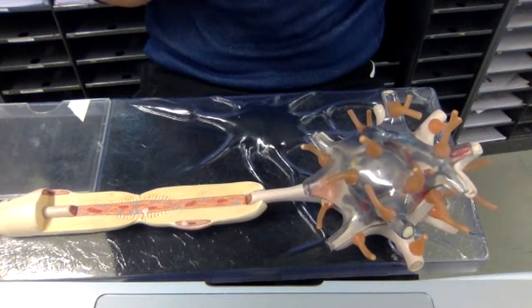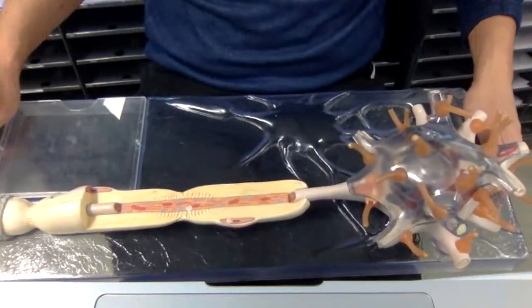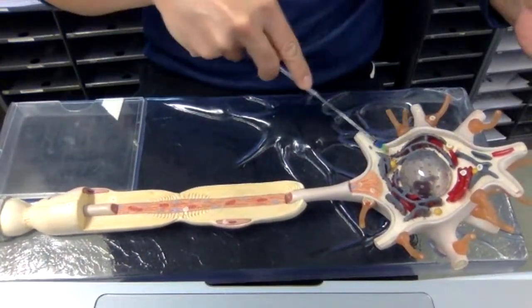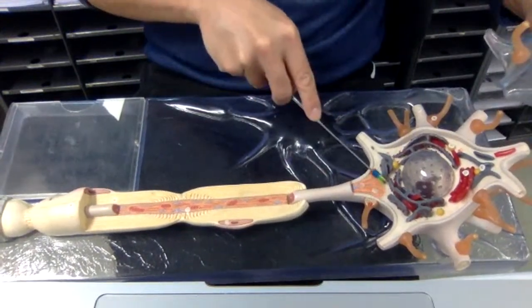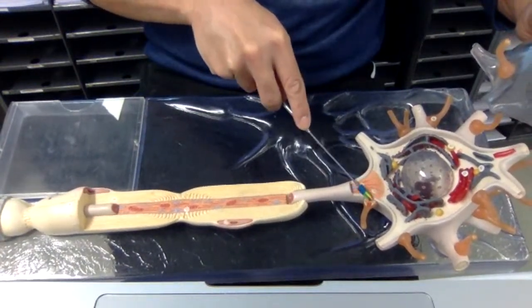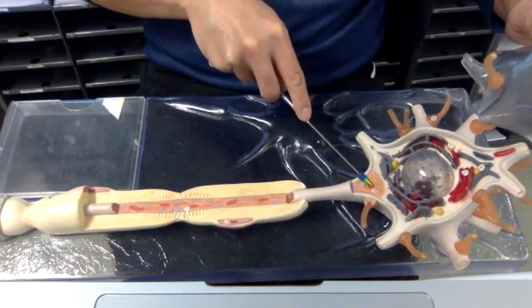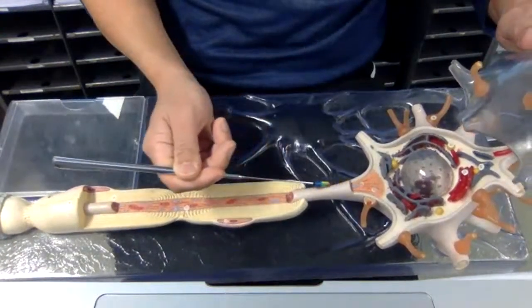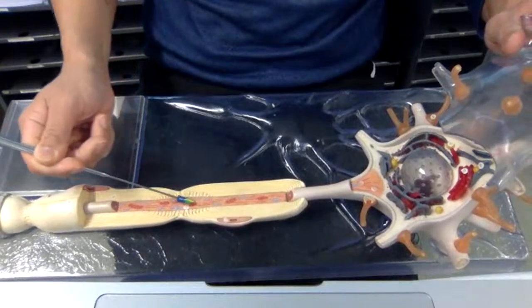It's multipolar. That's right, Emilio. So we have a multipolar neuron here. You can see the nucleus and all the other organelles on the inside. You can see the axon hillock right here. The axon hillock is where we have lots of voltage-gated channels, so this is our decision point. Are we going to have an action potential or not? See how the axon continues along here. We've cut into the axon so we can see inside of the axon.